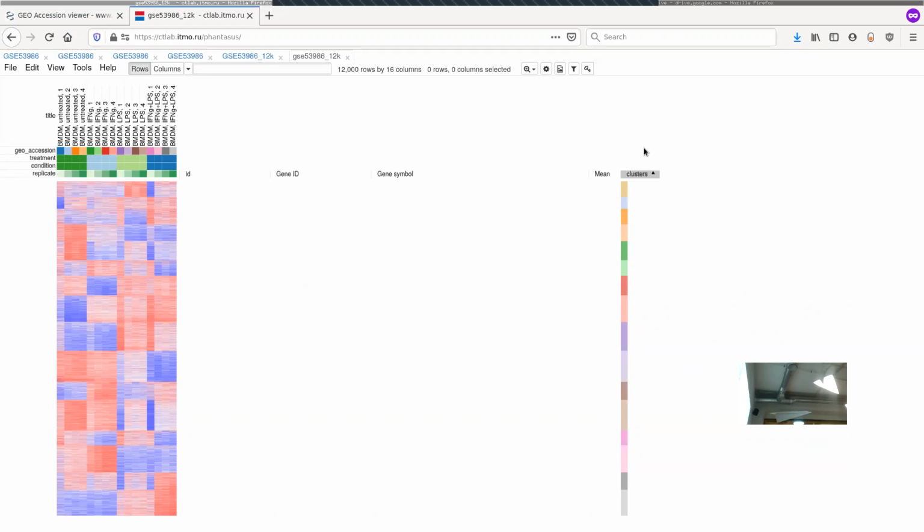There are some other clusters as well, but you can also see that the first samples that we were already suspicious about in our previous analysis are also suspicious here. The interferon gamma plus LPS first sample looks very different. LPS1 is different from the other ones, and in the interferon gamma and untreated there are some that are maybe not as pronounced, but also different.